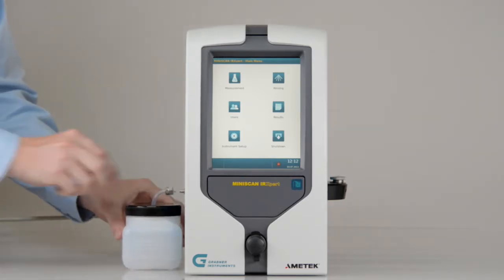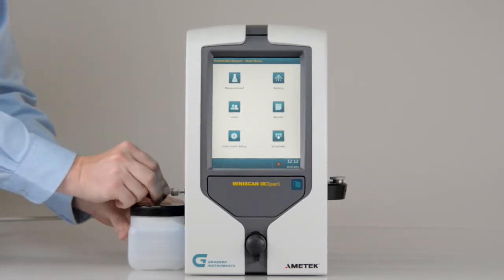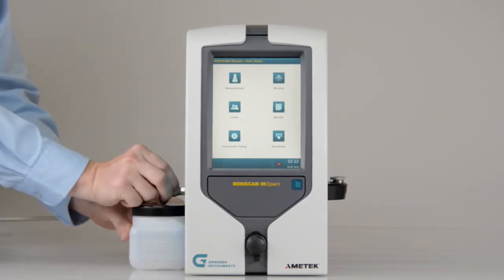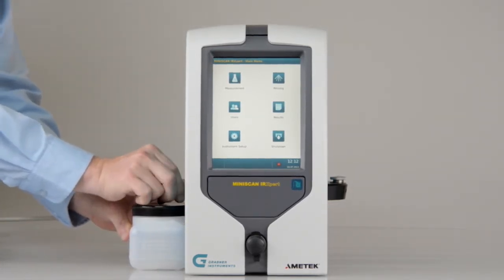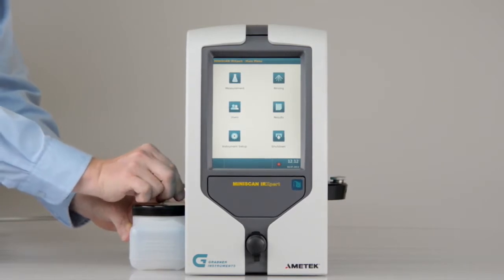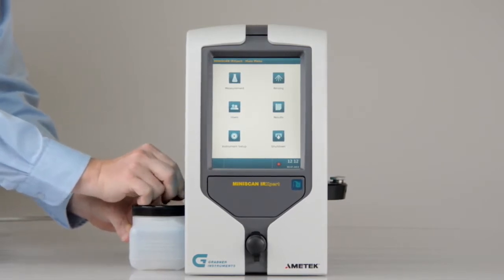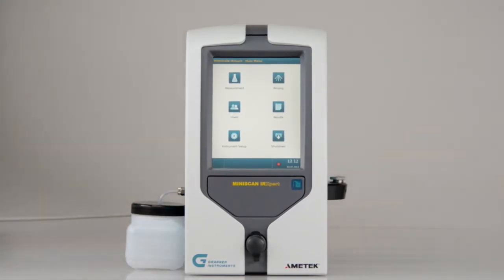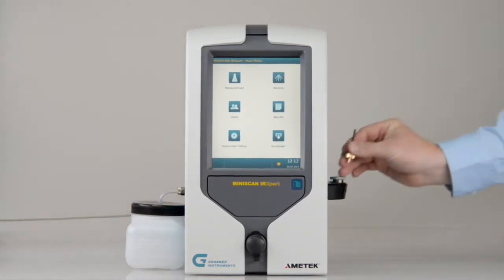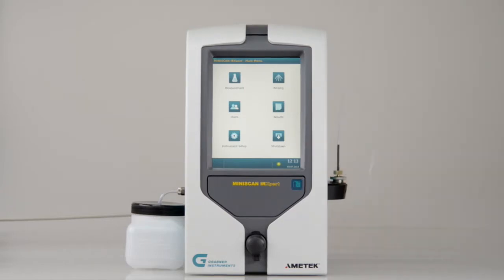Connect the waste container on the left side of the instrument. Connect the sample tube.